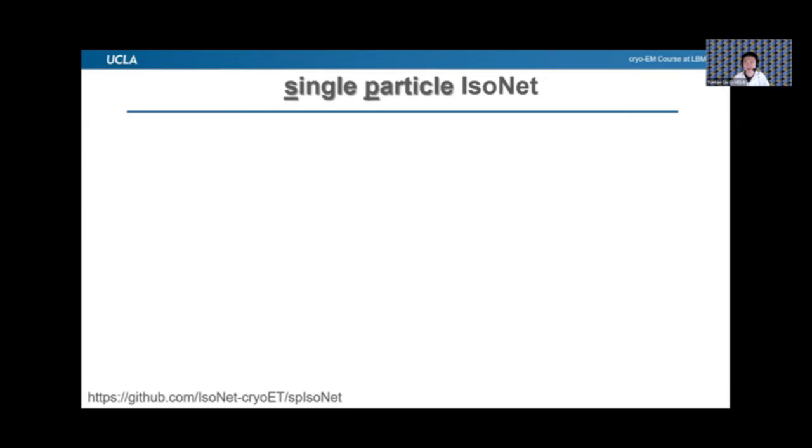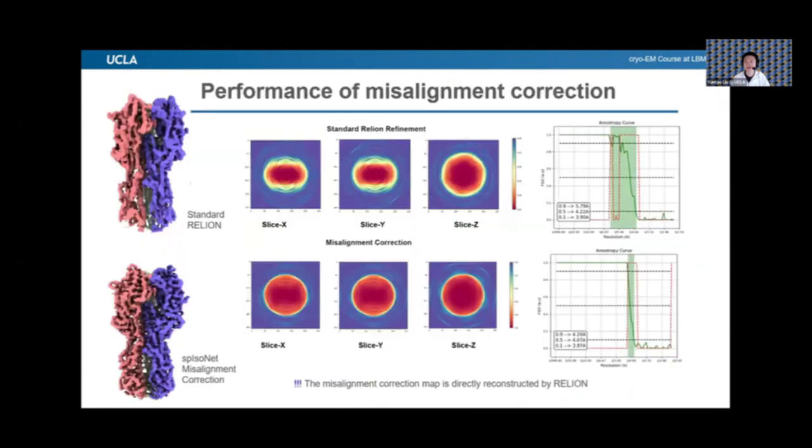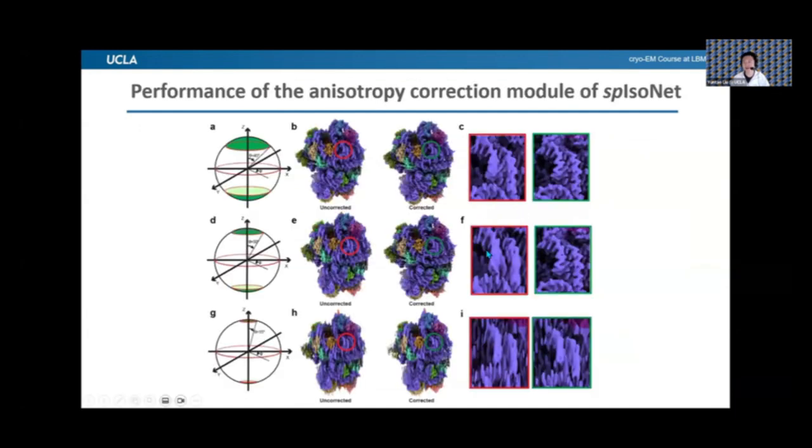Let me show the slides. So where is it? I think this is it. This one is a missing cone. For example, this 15 degree, we only keep the information in Fourier space within those small cones. Other places are completely removed. We literally put zero on these pixels, and then we do the simulation. So it's completely missing.